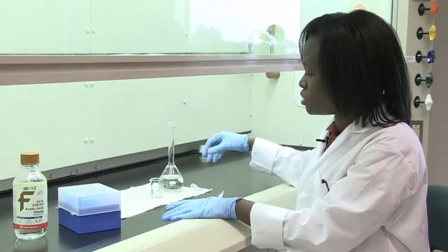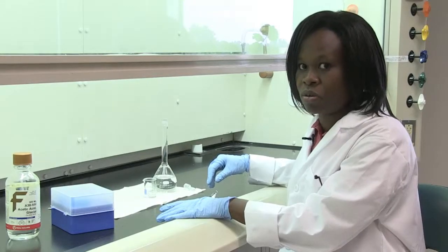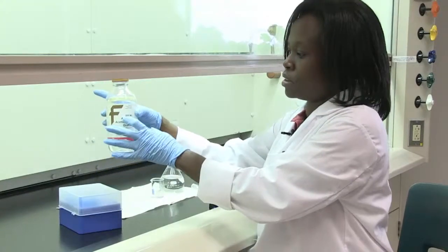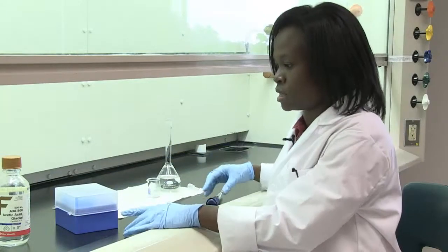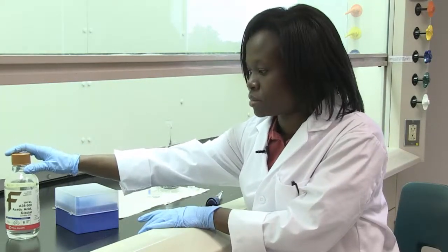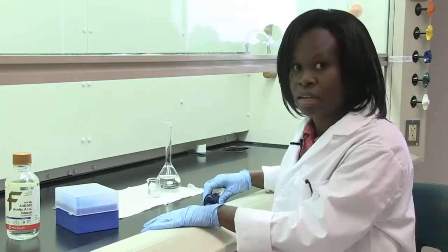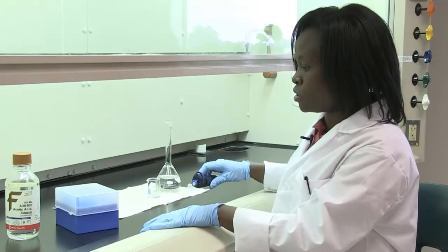In your instructions, you're given a specific weight of acetic acid to use. Because acetic acid is normally in liquid form, as you see here, you have to determine what volume you use by the density of acetic acid. When you get to the lab, you're going to look at your bottle of acetic acid and record the density of it, which is 1.05. Then you're going to calculate the volume you need based on the mass given in your directions.